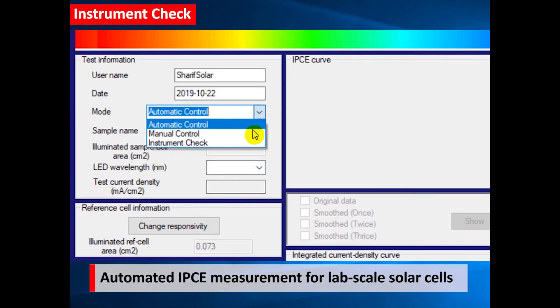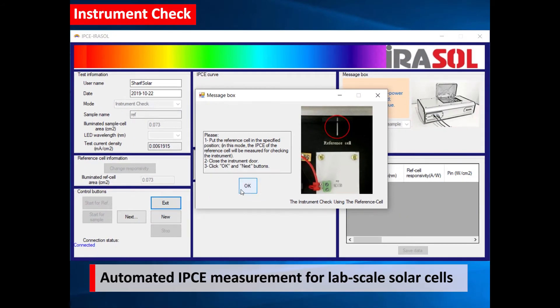To make sure about the validity of measurement, a system check mode is provided in the software.